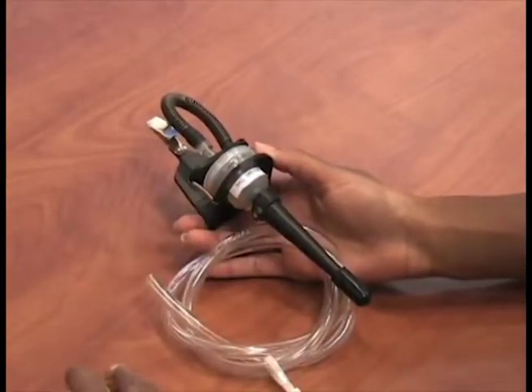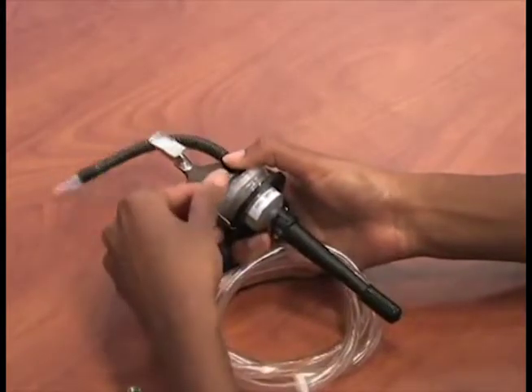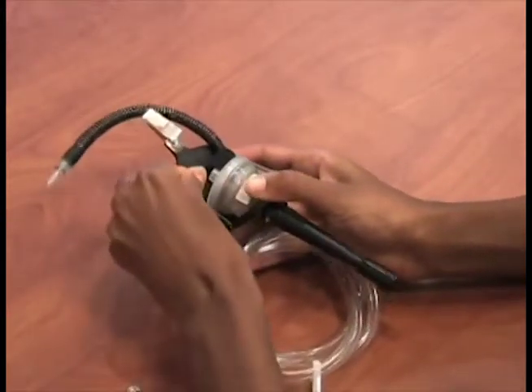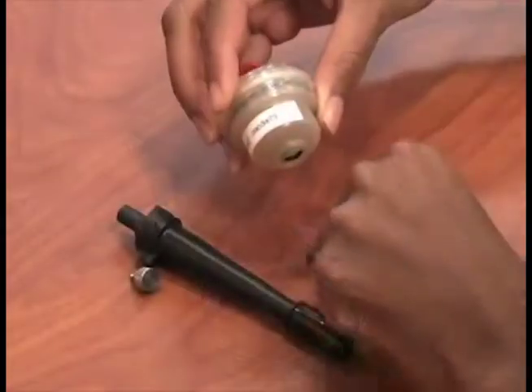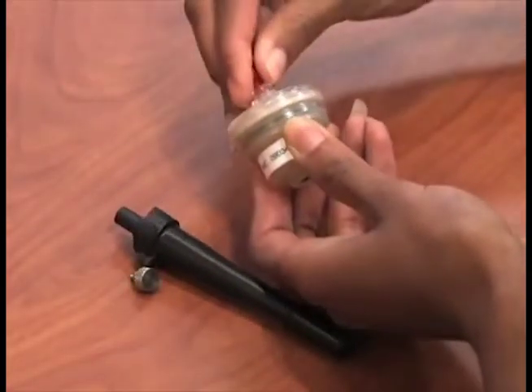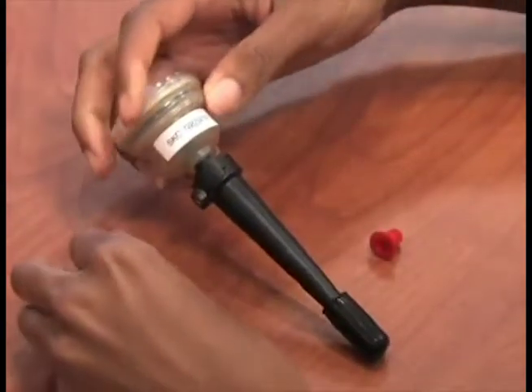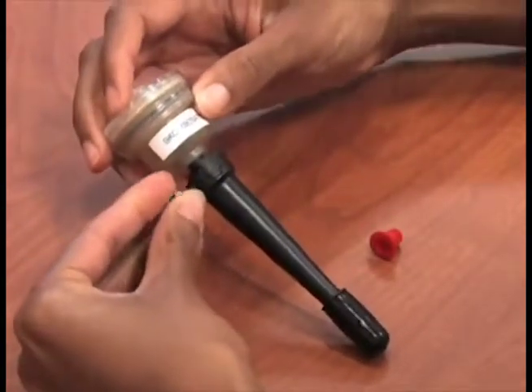To set up the cyclone for calibration, remove the thumb screw from the cyclone and remove the cyclone assembly from the cassette holder. Remove the blank cassette used for shipping only. Remove the inlet and outlet plugs from the DPM cassette. Place the impactor onto the cyclone and reinsert and tighten the thumb screw.